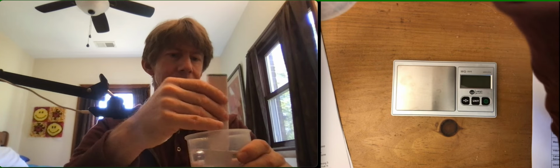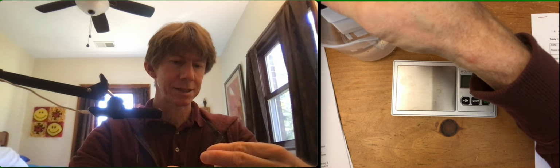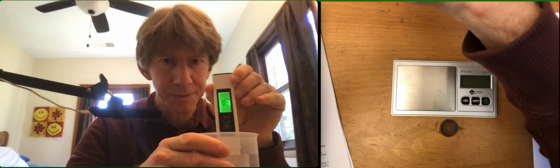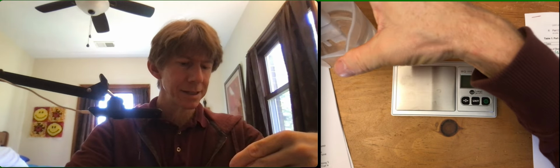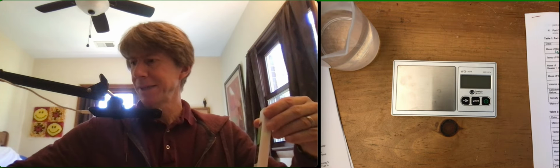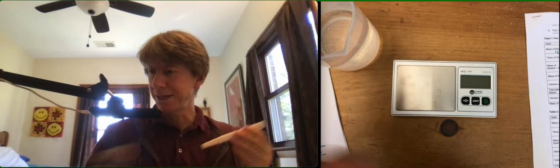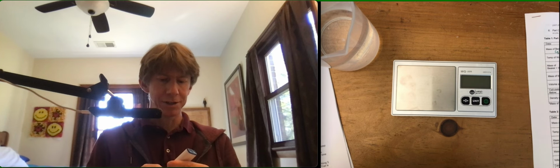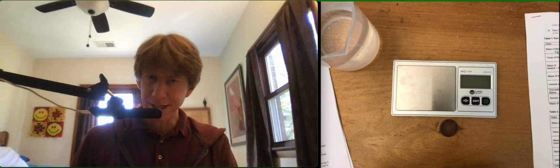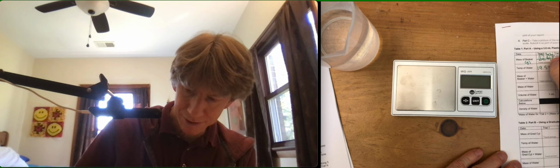And then I'm going to swirl it. And then I'm going to record the temperature. Oop, I got to get the temperature mode. And my temperature, I'll show it to you first. 19.5 degrees Celsius. I'm going to write that down. I've got a little paper napkin here, so I'm going to write that. Take that away. Turn it off. And I've got 19.5 degrees Celsius.